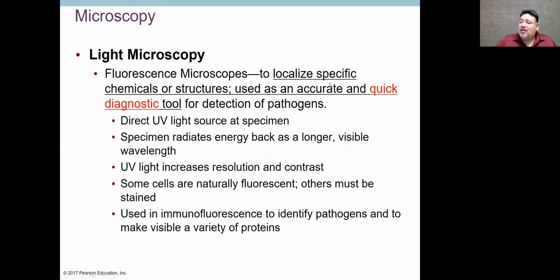Okay, we can see localized specific chemicals or structures within cells. Okay, and it is a quick diagnostic tool. This is probably the only diagnostic tool from a microscopy point of view. Very incredible stuff.